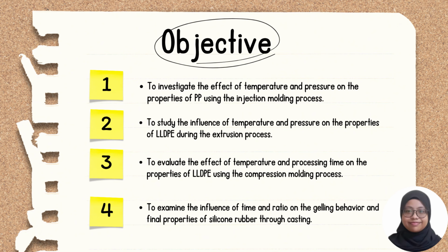Lastly, the fourth experiment is to examine the influence of curing time and mixing ratio on the gelling behavior and final properties of silicone rubber through the casting process.